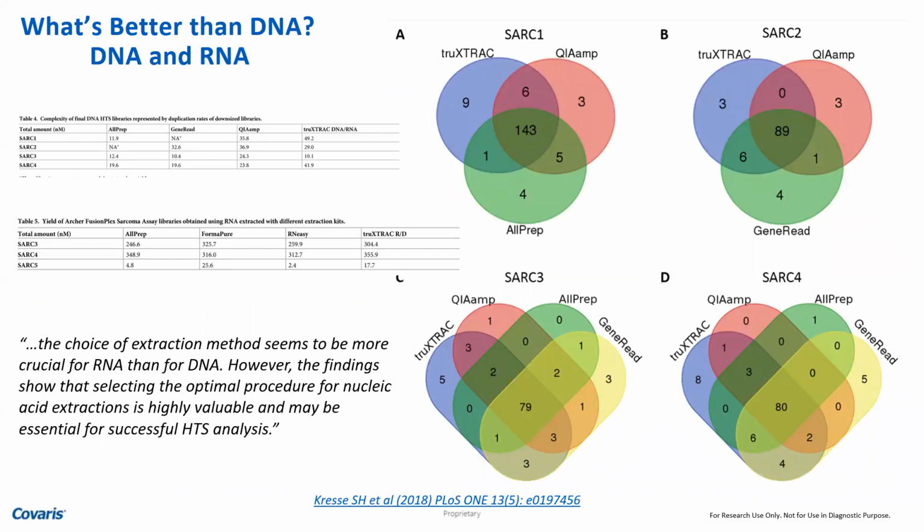If you just do basic math, these are all different sarcoma tissues that they are getting, different sources from different organ types. And if you look at the number of genes that they are identifying that can actually help them, whenever you have such situations, the more contact points or confirmation points you have, the better your result is, right?